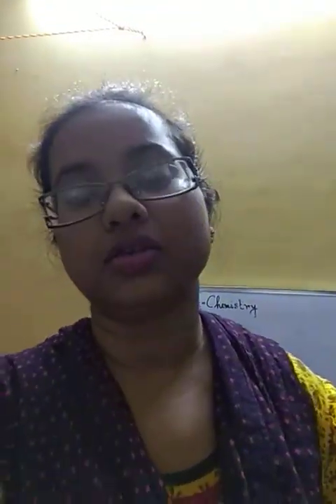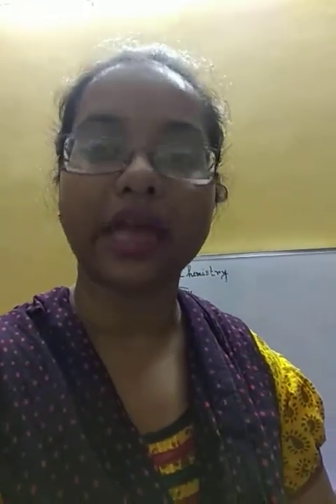Good morning, students. Welcome to today's activity class. Today I am going to show you some chemical reactions.